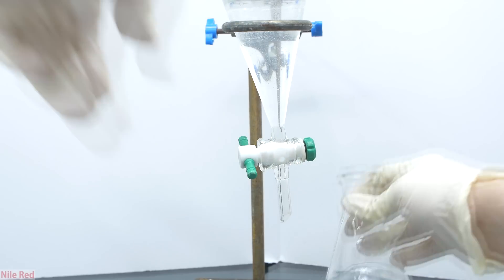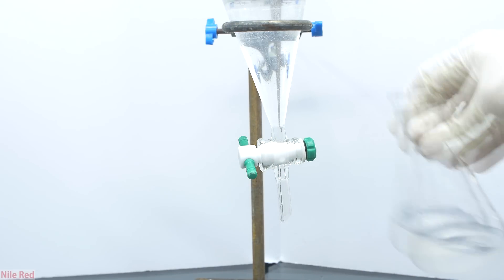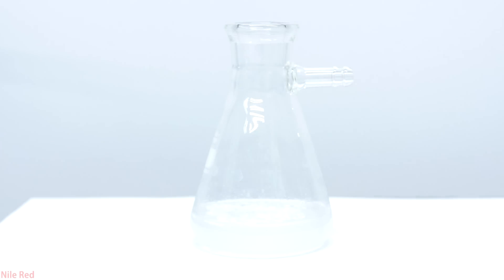Our now colorless methyl iodide solution is drained into an Erlenmeyer flask. It's a little blindingly white and hard to see here, but what we're doing is adding calcium chloride to remove any methanol or water that might remain. You can see that before it's added it was a little bit cloudy, but afterwards it quickly clears up.